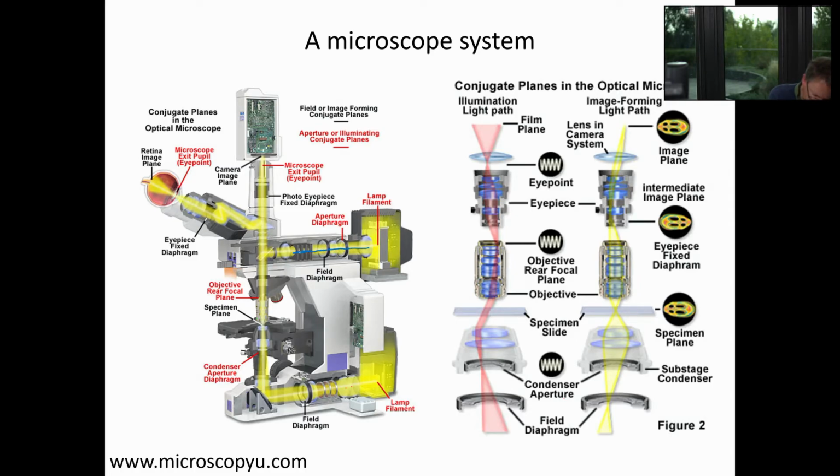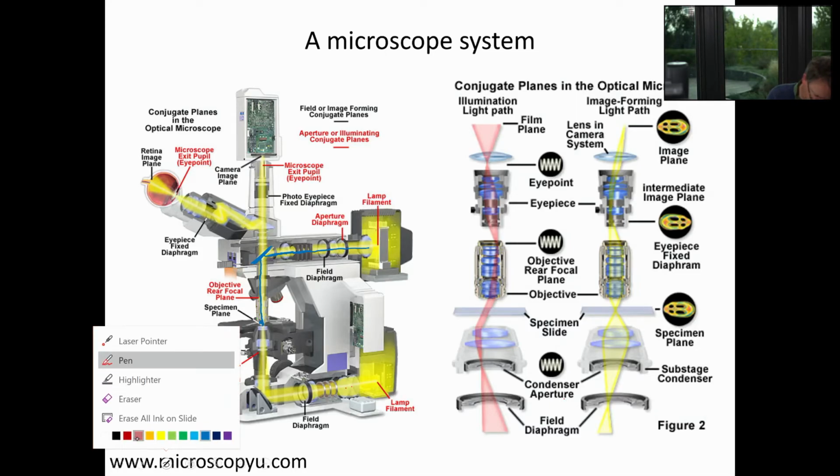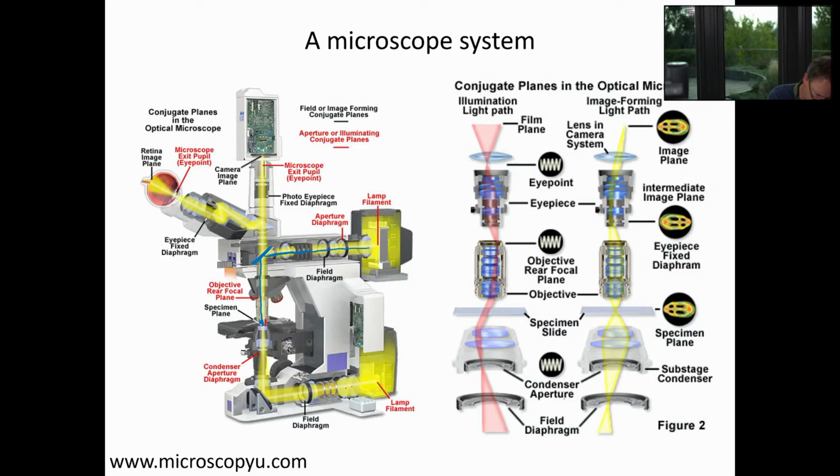It goes now through filters, so I have the right color to excite the molecules that I'm interested in. So here's the dichroic that I showed you earlier on. The excitation light goes through the objective onto the sample, and then the sample fluorescence is redshifted, so it will come through.